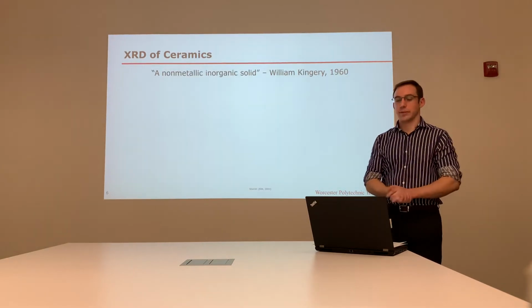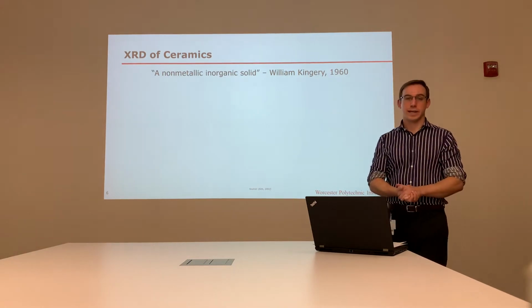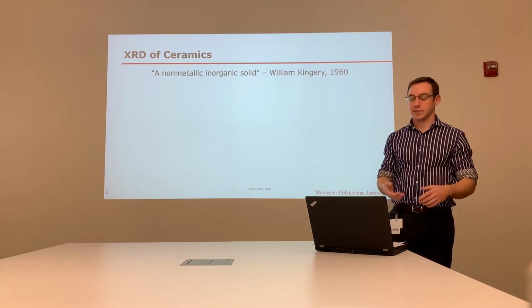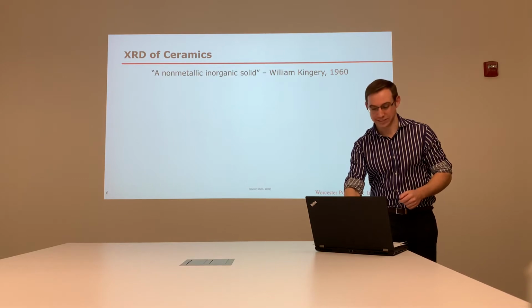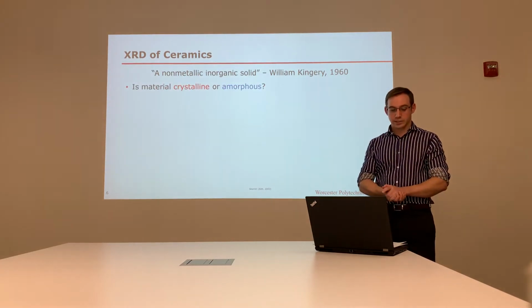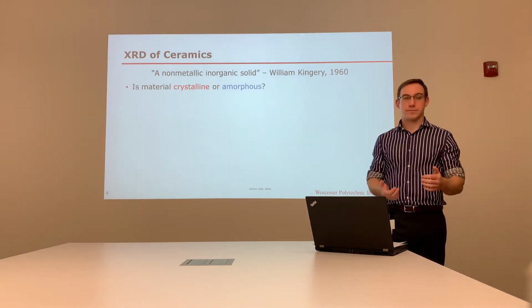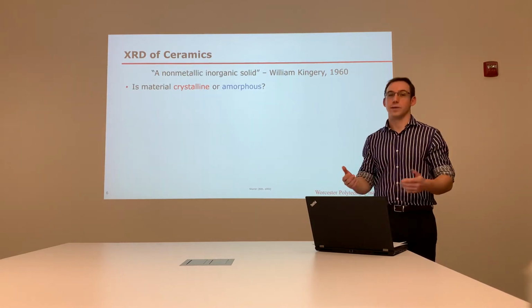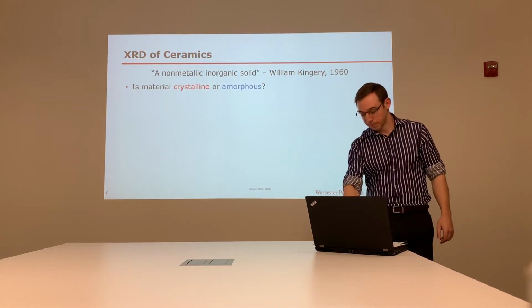And moving on to ceramics, William Kingery, who's regarded as the father of modern ceramics, defined a ceramic as a non-metallic inorganic solid. And that's a very broad definition, but it is comprehensive. So the goal of X-ray diffraction is to determine the atomic structure of a material. And to this point, fundamentally, we want to know, is the material crystalline or is it amorphous? And what impact does that have on the actual X-ray diffraction pattern?